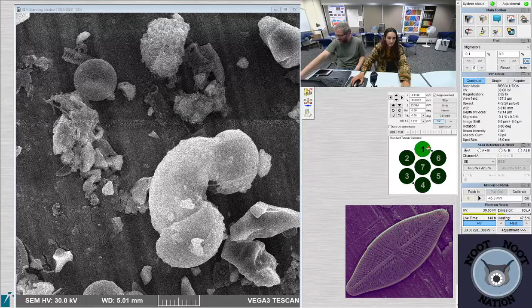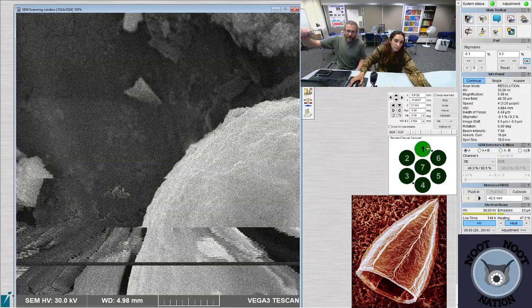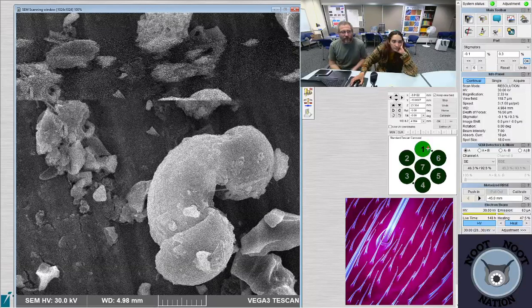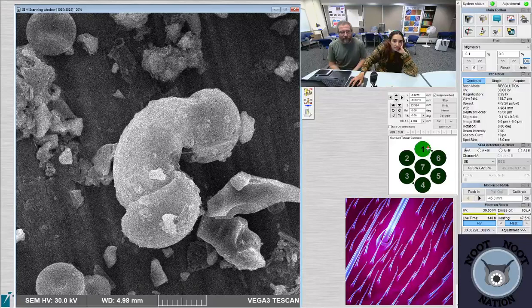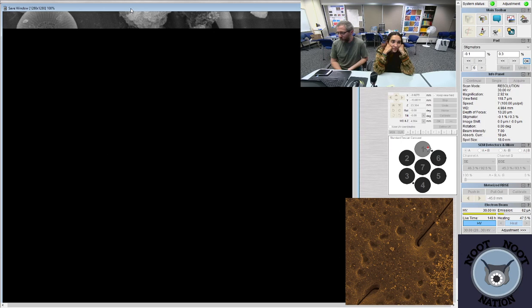What's the sample coated with to reflect electrons? Well, they'll reflect electrons by themselves, because the electron beam comes in and knocks electrons out. The gold coat over top of them is not to help reflect electrons, but rather to discharge them from the surface. So the coating is more an attempt to disperse electrons than to actually reflect them. But same idea, or similar idea.